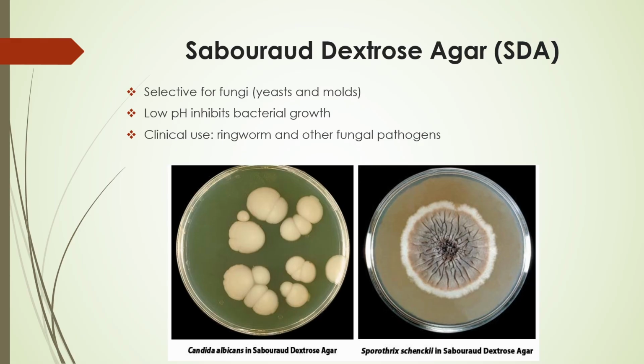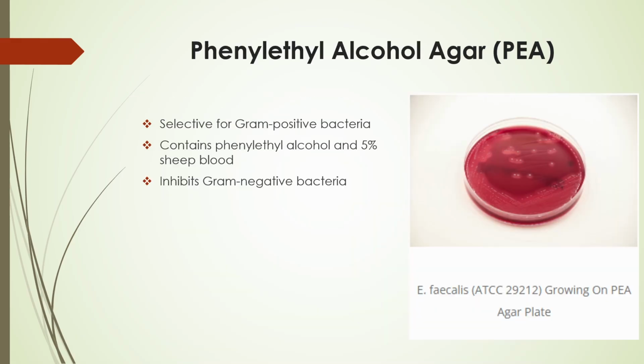SDA is frequently utilized in pharmaceutical testing, medical labs, and environmental monitoring, where precise fungal separation is required, because of its ability to favor fungal species. This medium aids in diagnosis and quality control by separating bacterial flora from fungal pollutants or pathogens in mixed samples.